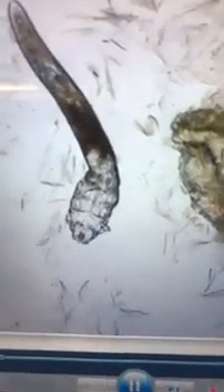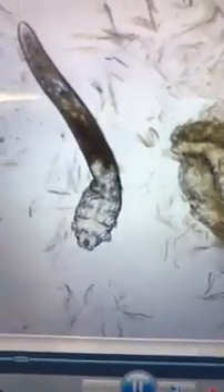You can actually see the legs are moving. It's not a very stable image, sorry about that. If anyone ever gets itchy at night — even during the day — and doesn't know why, it's probably an overpopulation of Demodex mites. You can see their little legs moving there.